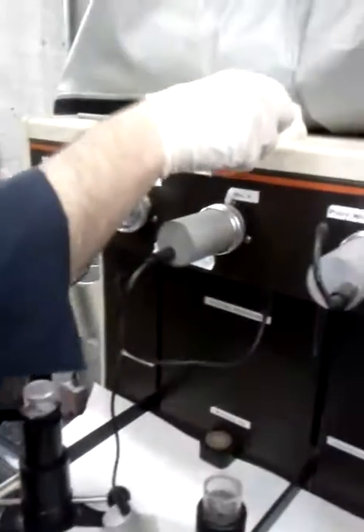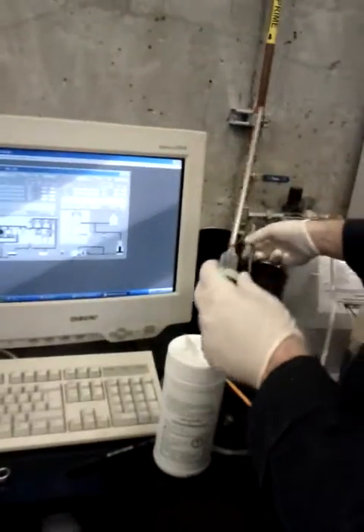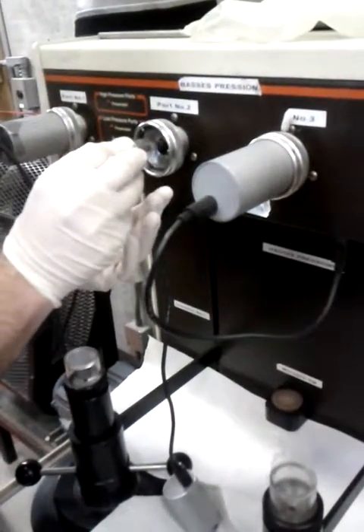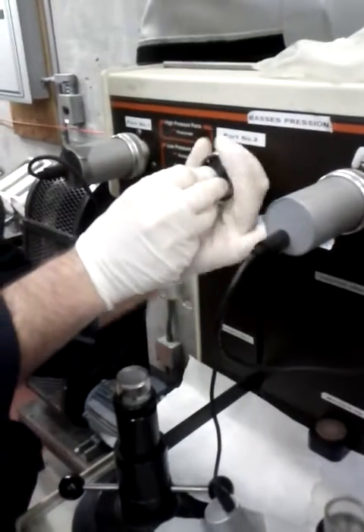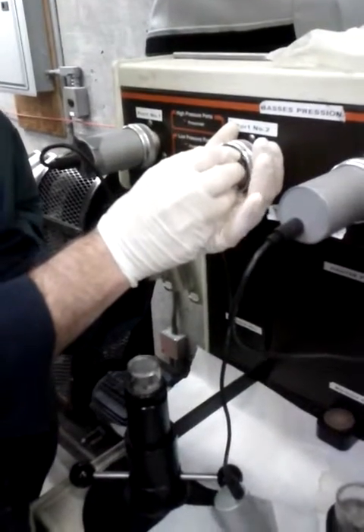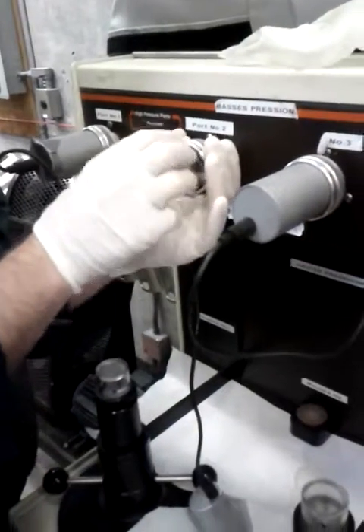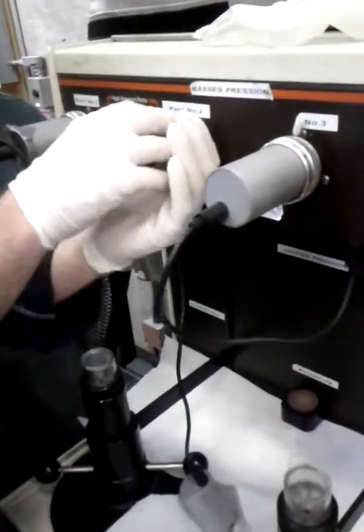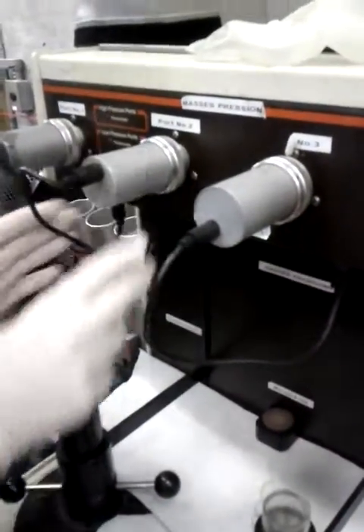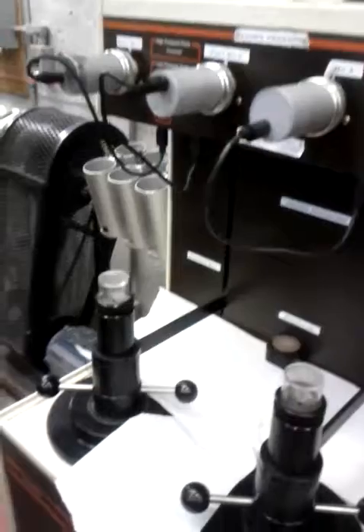Put it here. And after that, okay, this is the first port that I use. So I will take the penetrometer, this is the first one. Go through and then we have to screw this. We only have to be able to remove it, but it's not necessary to tighten it hard. And after that we reinstall the cover. And it's okay for the first one.